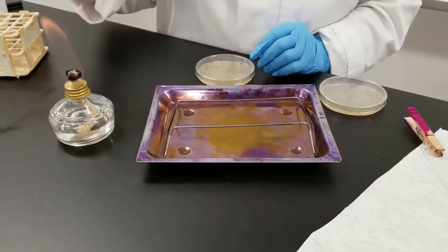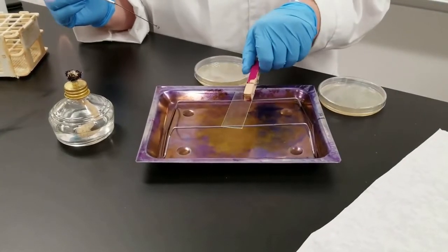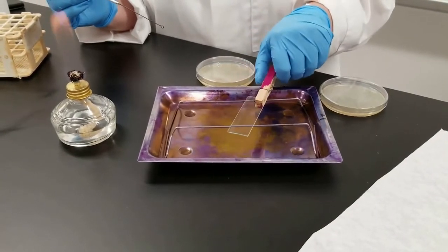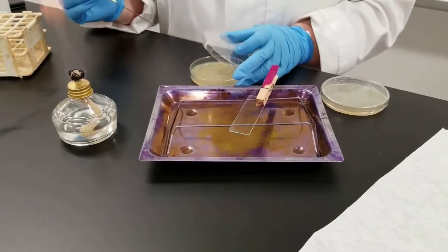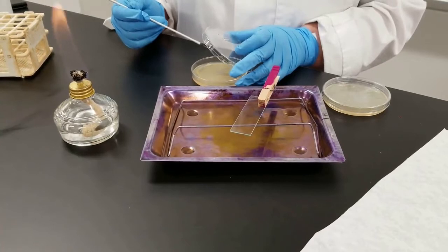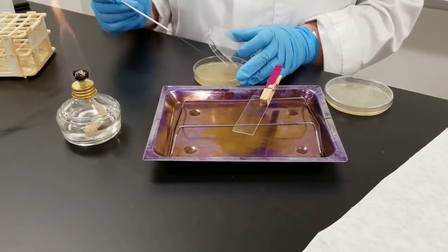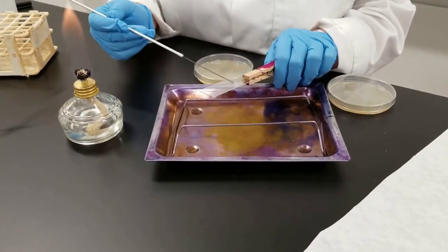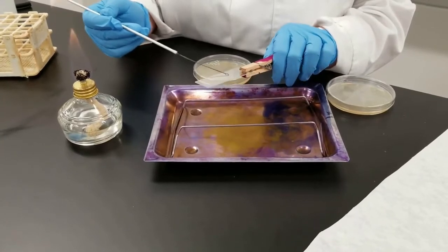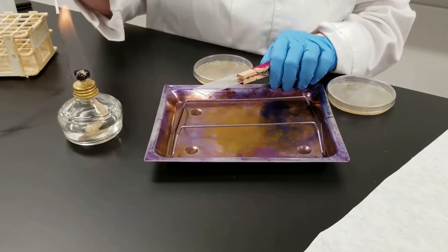The first thing we're going to do, as always, is to flame our loop. We have a slide ready to go here. I have two different cultures. The first one that I'm going to do right now is Staphylococcus aureus. So I'm going to take a culture, make a smear here, and flame my loop.